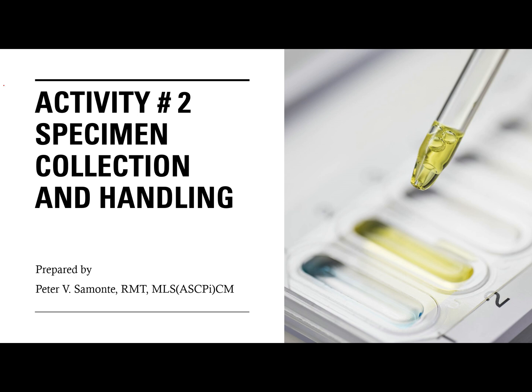Hey class. So for our meeting today, we're gonna have the discussion on activity 2, which would tackle specimen collection and specimen handling. As medical technologists who work in the laboratory, it's very important that you know how to analyze or identify properly collected samples and how you would handle them and process them accordingly. If you're unable to process them accordingly, or if you accept samples that are improperly collected, this may cause problems in your result.